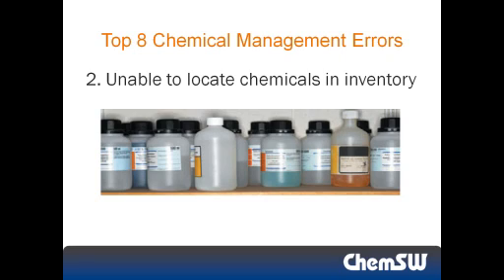The chaos continues with the information captured. If there's no process in place and if it's just left up to the people, this leaves simple inventory tasks up to highly paid research professionals who, just based on the time that they have during the day, will only put the bare bones information in, if at all. The end result is there will not be any standardization of information about the material coming on site. This is a huge problem, especially when the materials are hazardous, very expensive, or highly regulated.